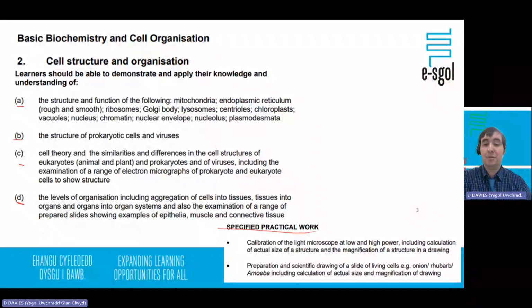So you need to learn how to calibrate the light microscope, and calculations of actual size, magnification, and all the rest of it. That's something that students can find quite daunting and quite difficult, but hopefully we will break it down and it will be nice and easy for you.